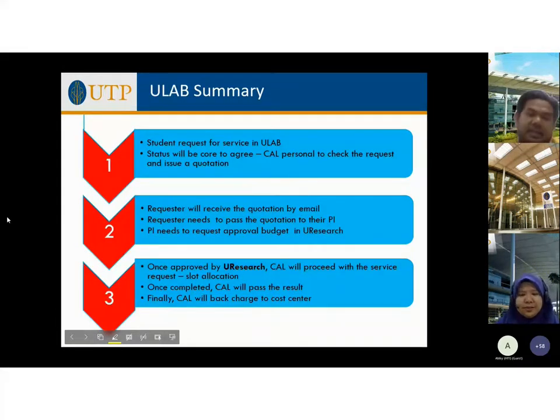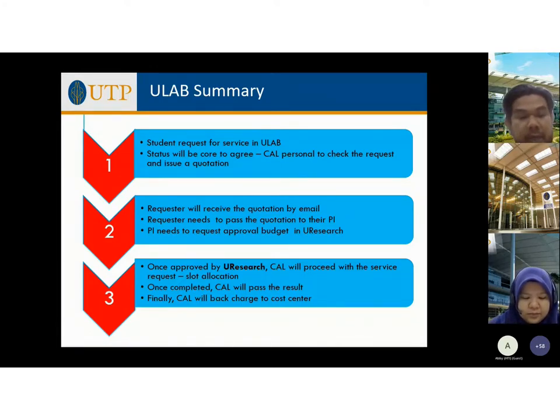This is what happens when you do a booking. It's a ULAB summary. Students normally request for service in ULAB, and then the status will be called to agree, and then personnel are called to check the request and issue a quotation. This is all done by our technologists.